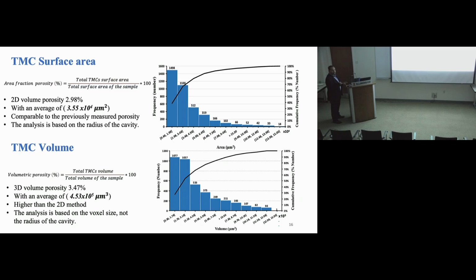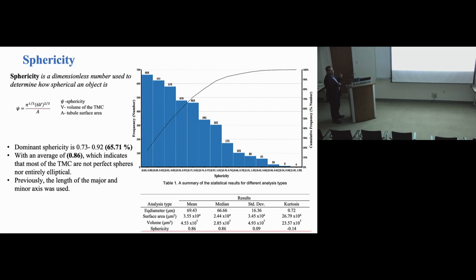So there is variation in sizes and variation in shapes, which I think is one of the things that makes the hoof mechanically important, because there is variation, so each scale can help in mechanics. This is what I think. I'm not 100% sure. I have to dig through and understand more, but this is something that captured my eye when I was doing this kind of analysis.